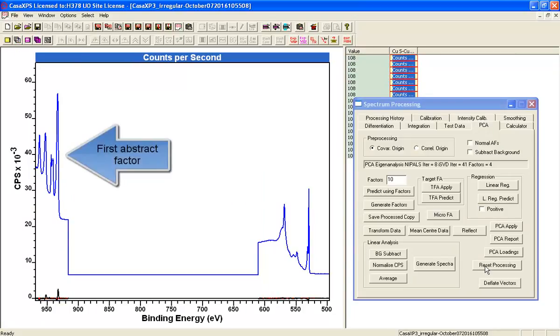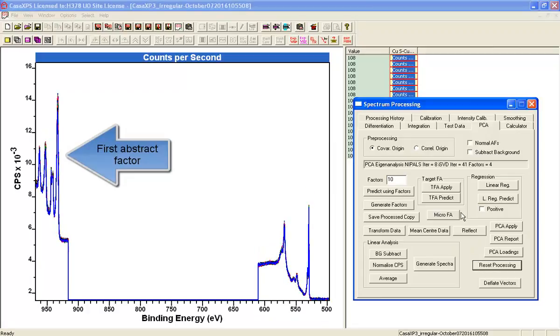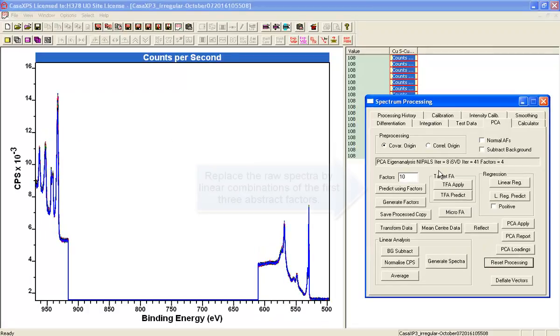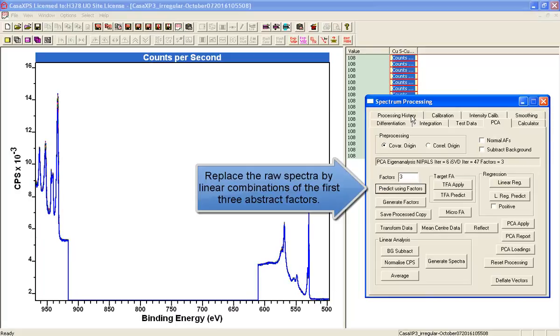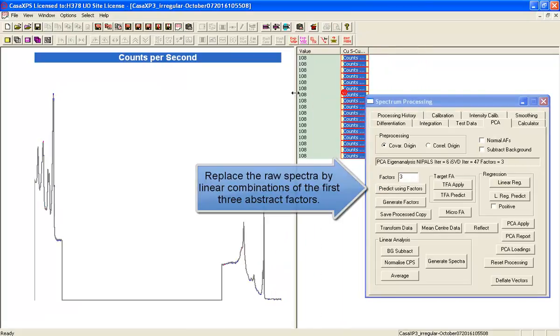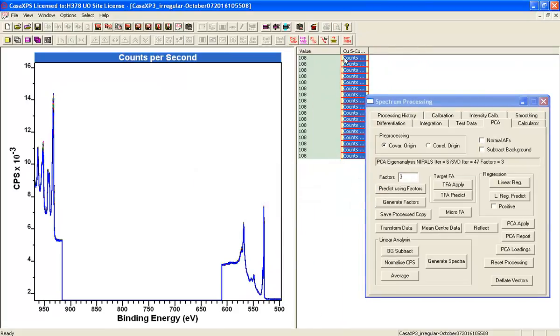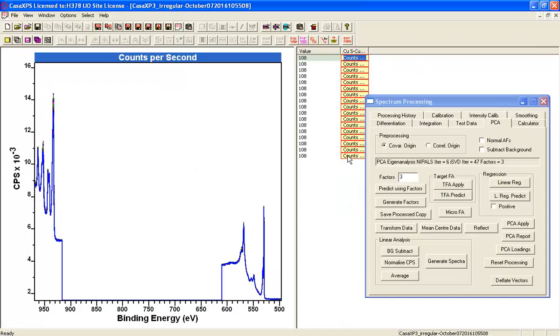And just on a quick inspection, you can see that 2 would be sufficient. 3 would be more than sufficient. So we'll reproduce using 3 and ultimately we will have now obtained a set of spectra that are noise reduced.